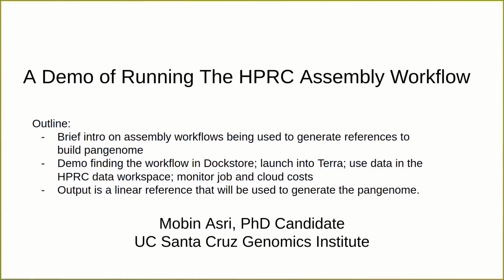In this part, I'll go through the steps that you need to know if you want to use the workflows we have been developing for the Human Pangenome project. After this section, you will be able to find the HPRC workflows from Dockstore, import them to a Terra workspace, run the workflows on Terra, and finally receive the outputs of your run.